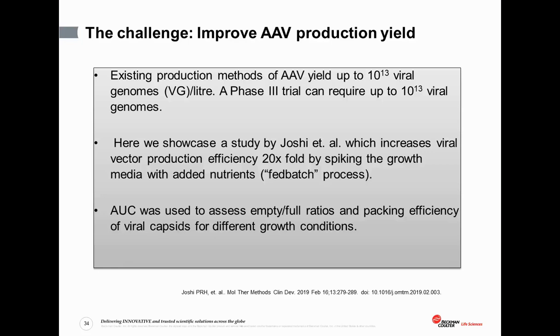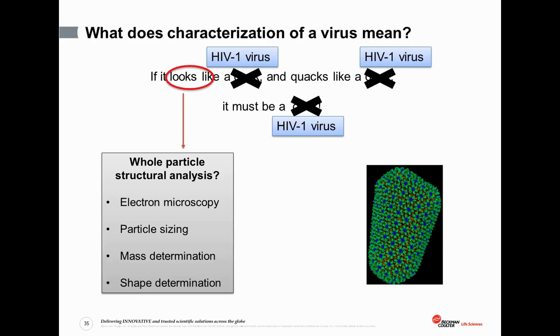Now that's great. However, just having a large output of virus particles is of course not enough. You need to know whether those virus particles are actually bioactive. In other words, are they actually going to be useful in the gene therapy context? And that is really the question for which AUC was employed by Joshi and co-workers. And that's what we're going to be talking about.